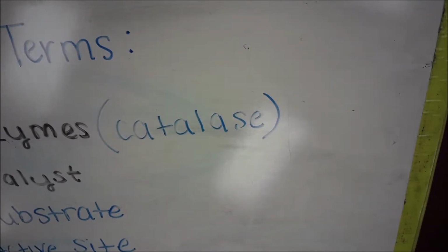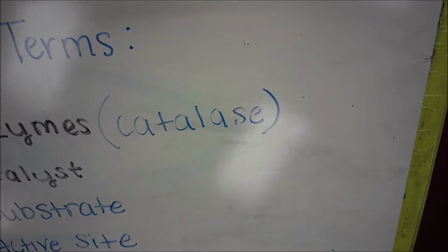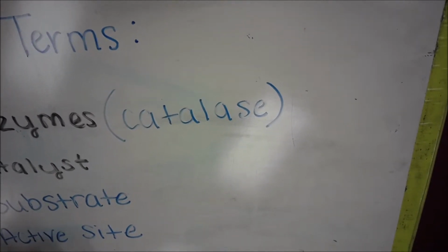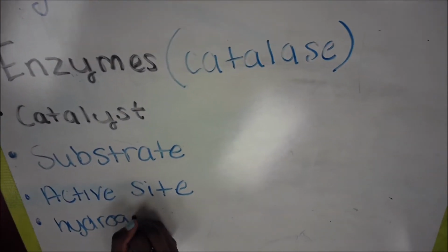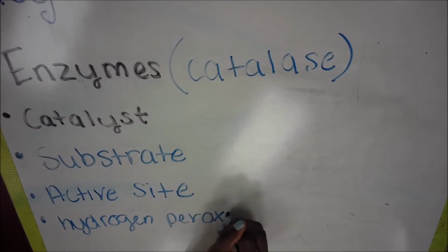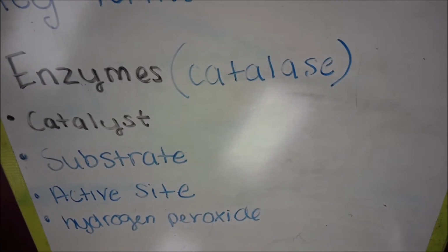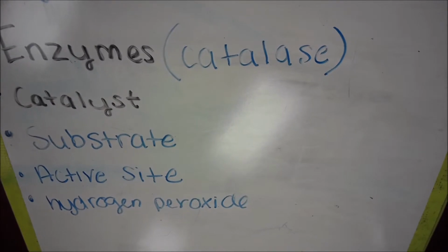Catalase is ubiquitous in nearly all organisms. One function of catalase within cells is to prevent the accumulation of toxic levels of hydrogen peroxide, a byproduct of metabolic processes. Catalase is part of many oxidation reactions that occur in all cells. The primary reaction catalyzed by catalase is the decomposition of H2O2 to form water and oxygen.